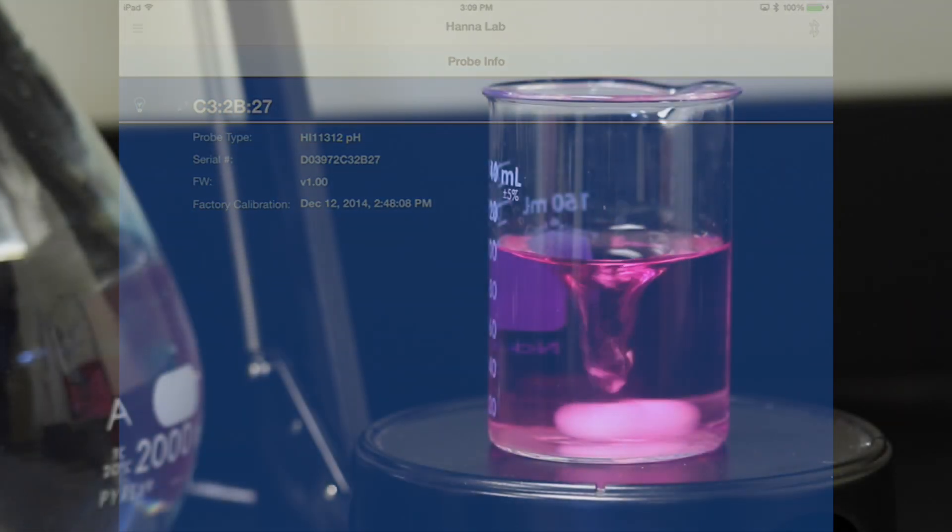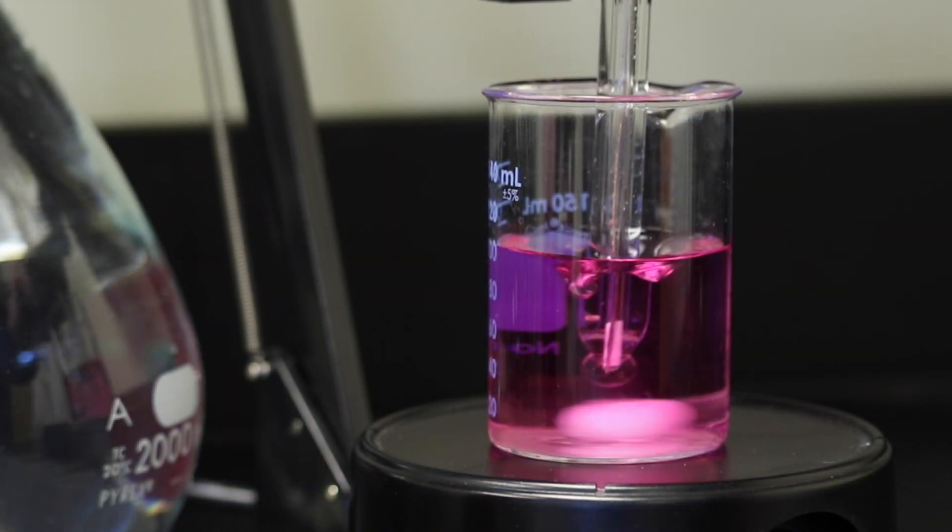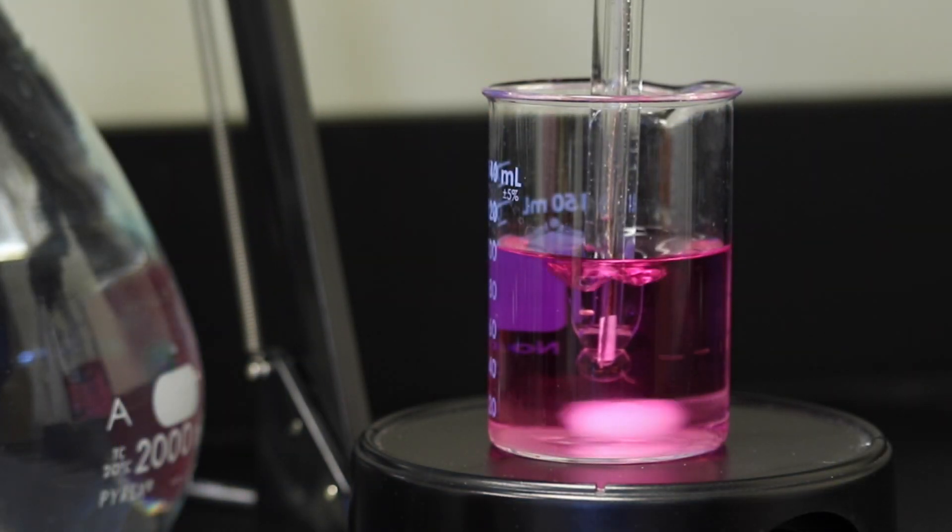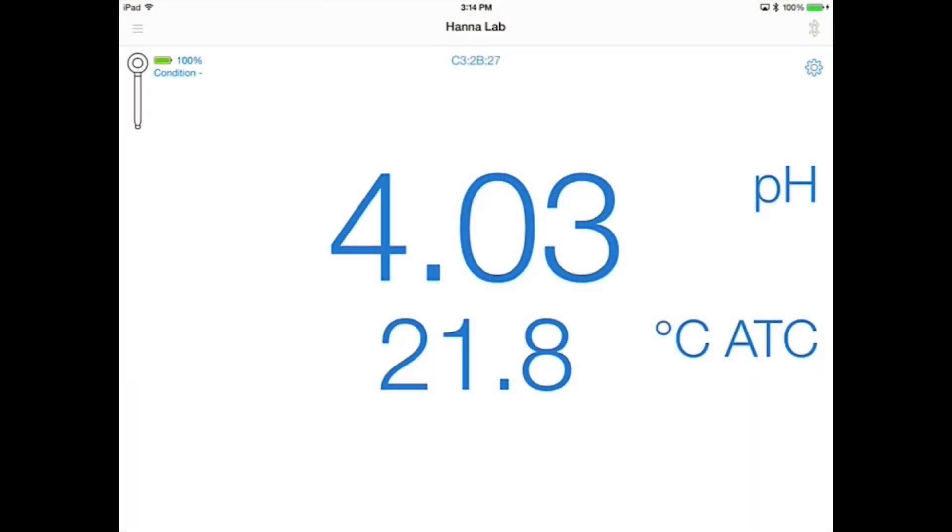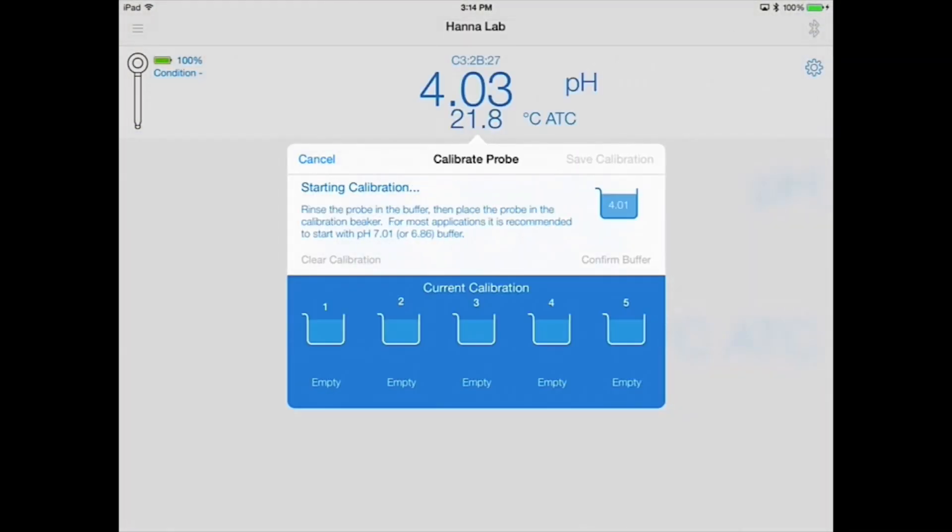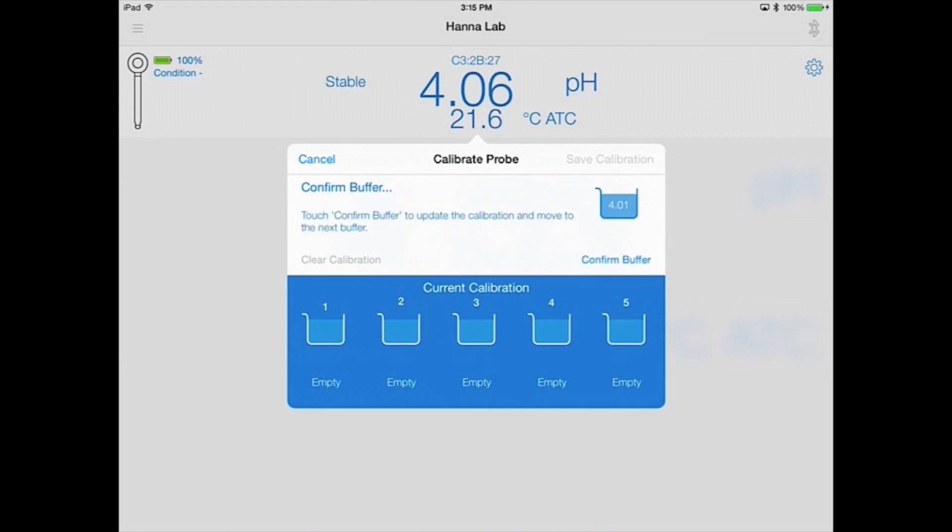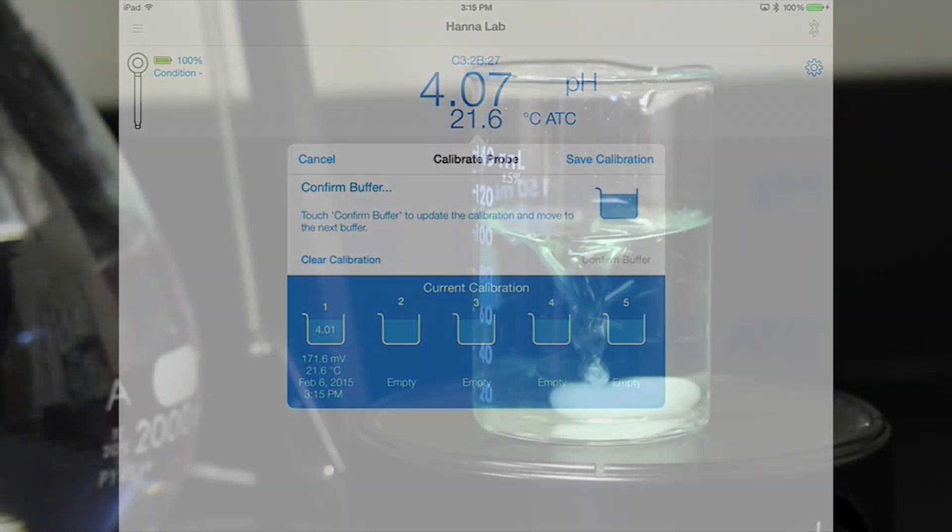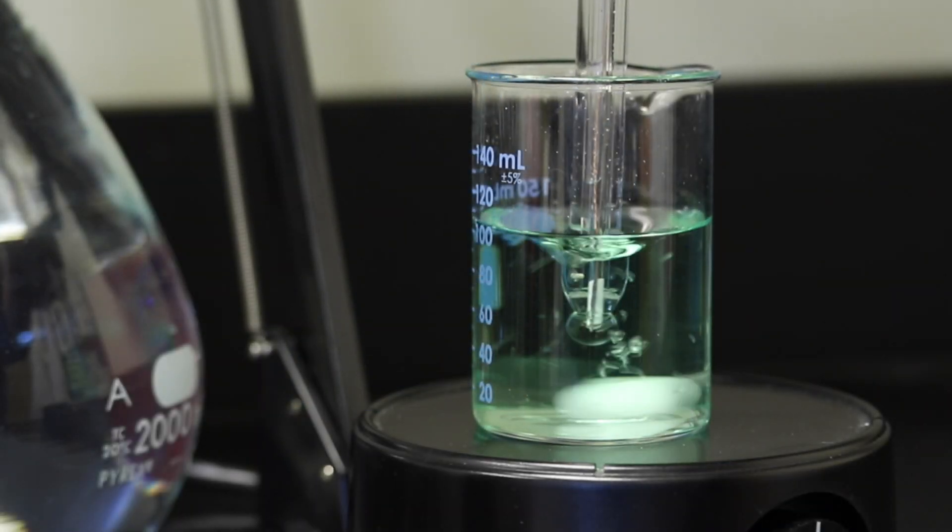Place your electrode in the first calibration buffer. Tap the gear icon and select calibrate to begin calibration. You'll have the option to clear the last calibration. The app will automatically recognize your current buffer. Once it's stable, confirm the buffer, rinse your electrode, and place the sensor into your next calibration buffer.